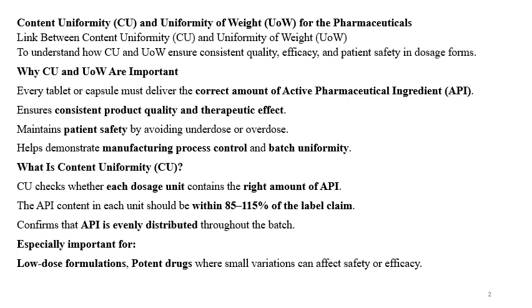Why are CU and uniformity of weight important? Every tablet and capsule must deliver the correct amount of the API, the correct amount of the drug substance, and it is directly related to safety and efficacy. It ensures consistent product quality and therapeutic effect.